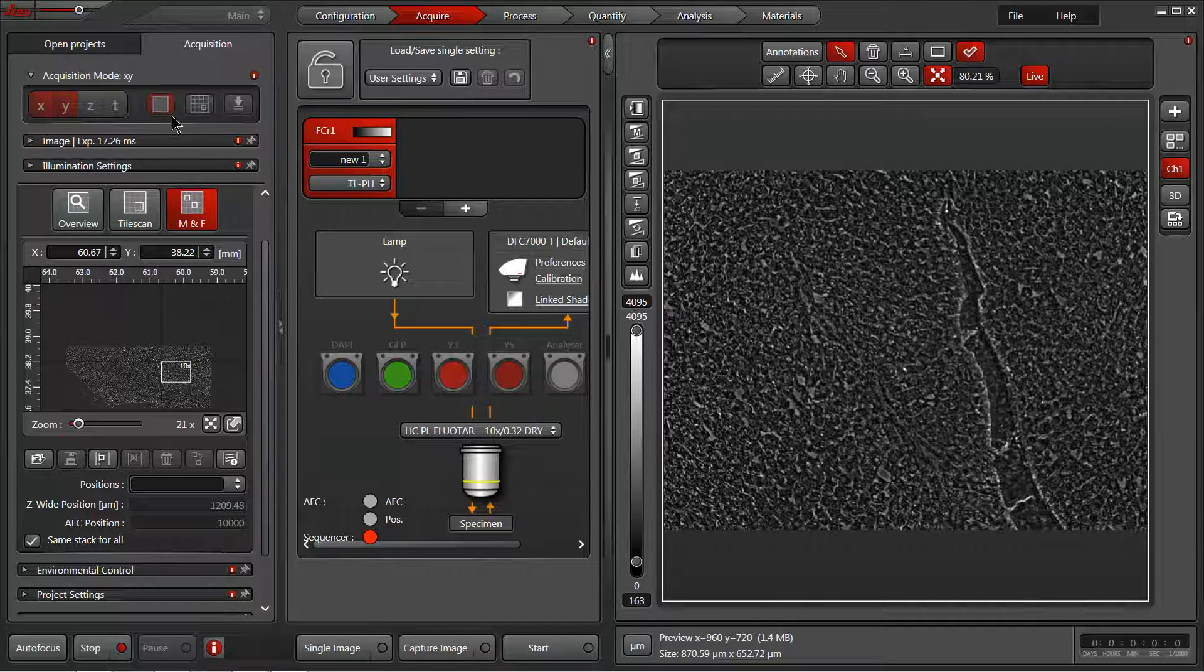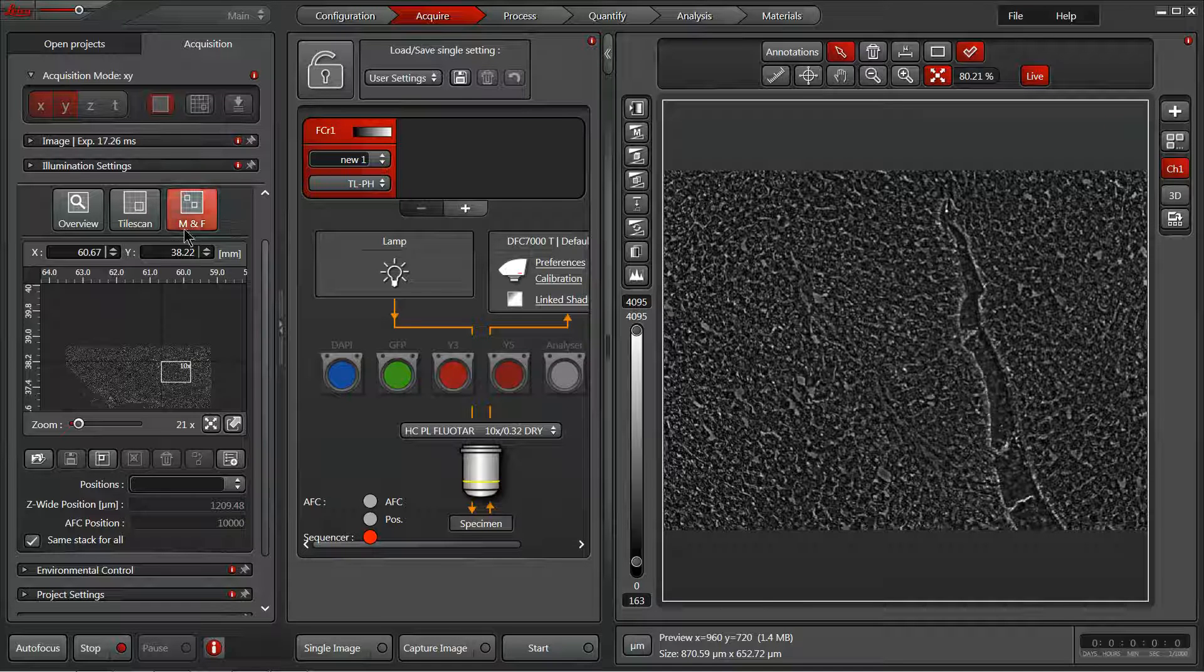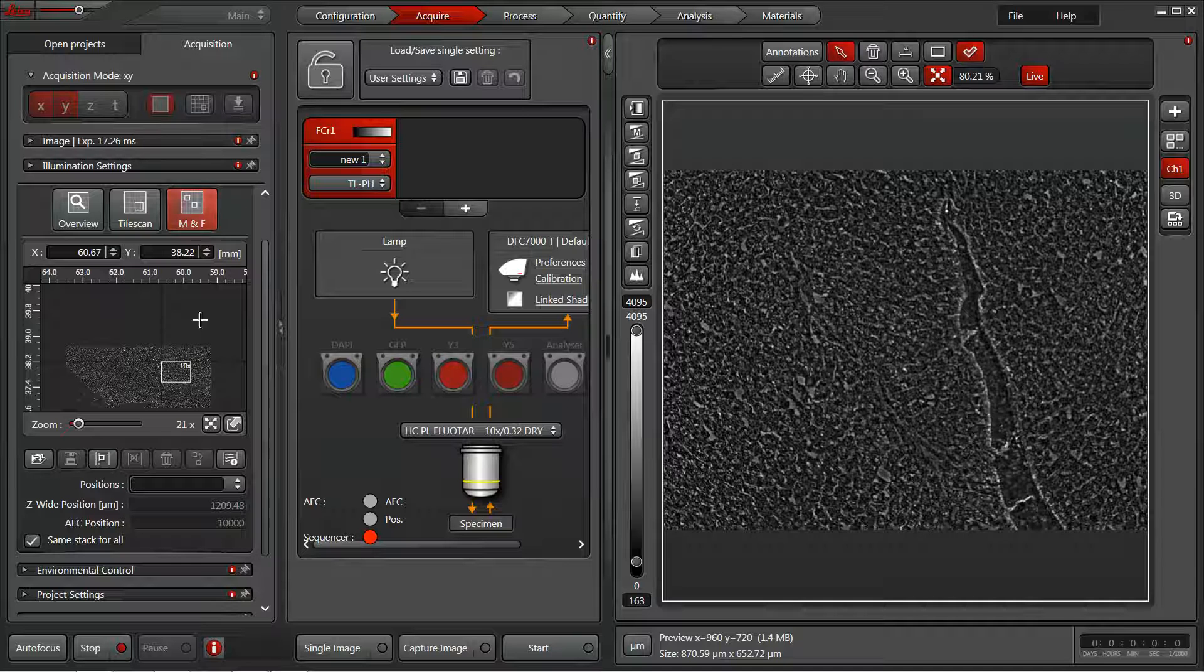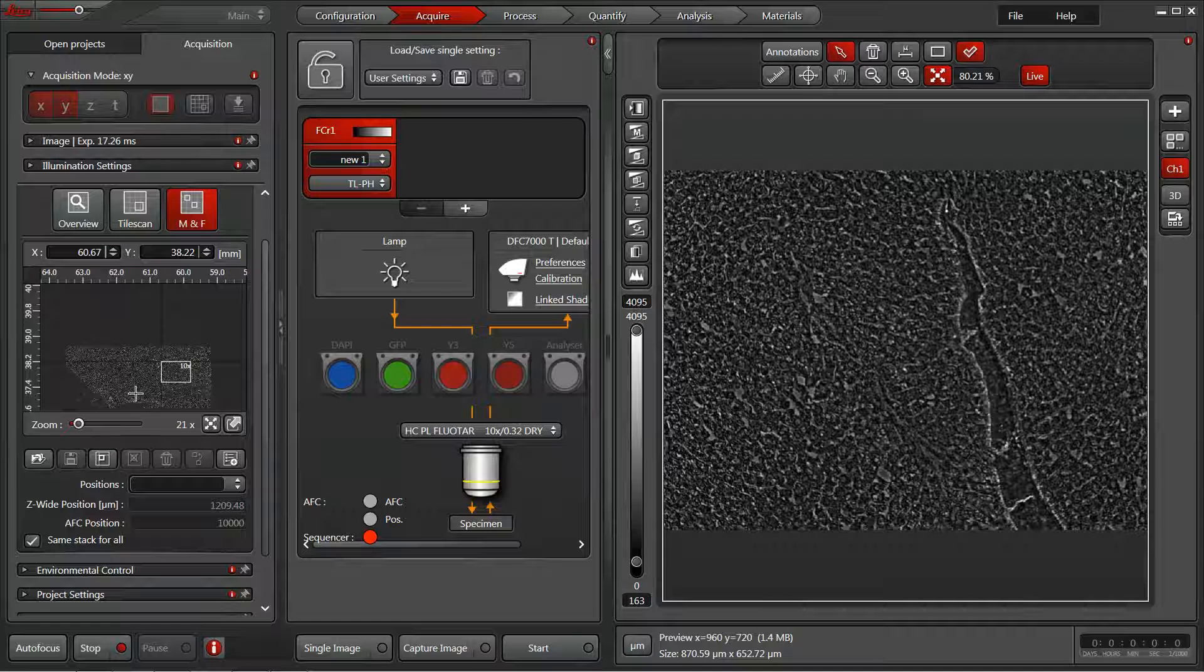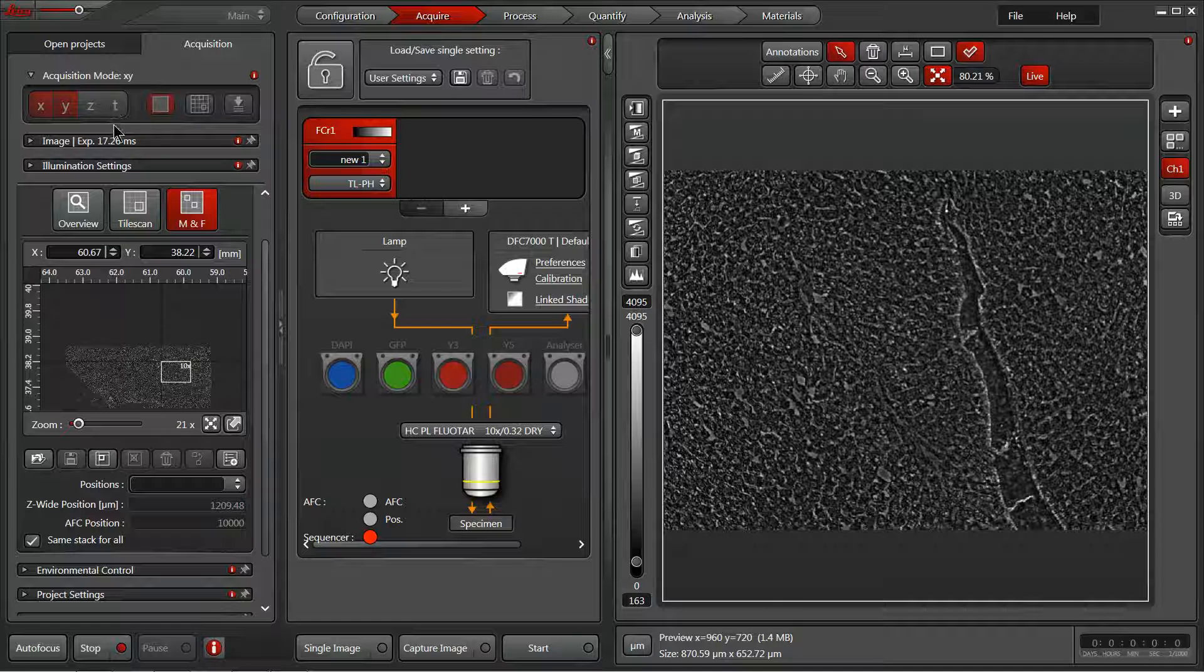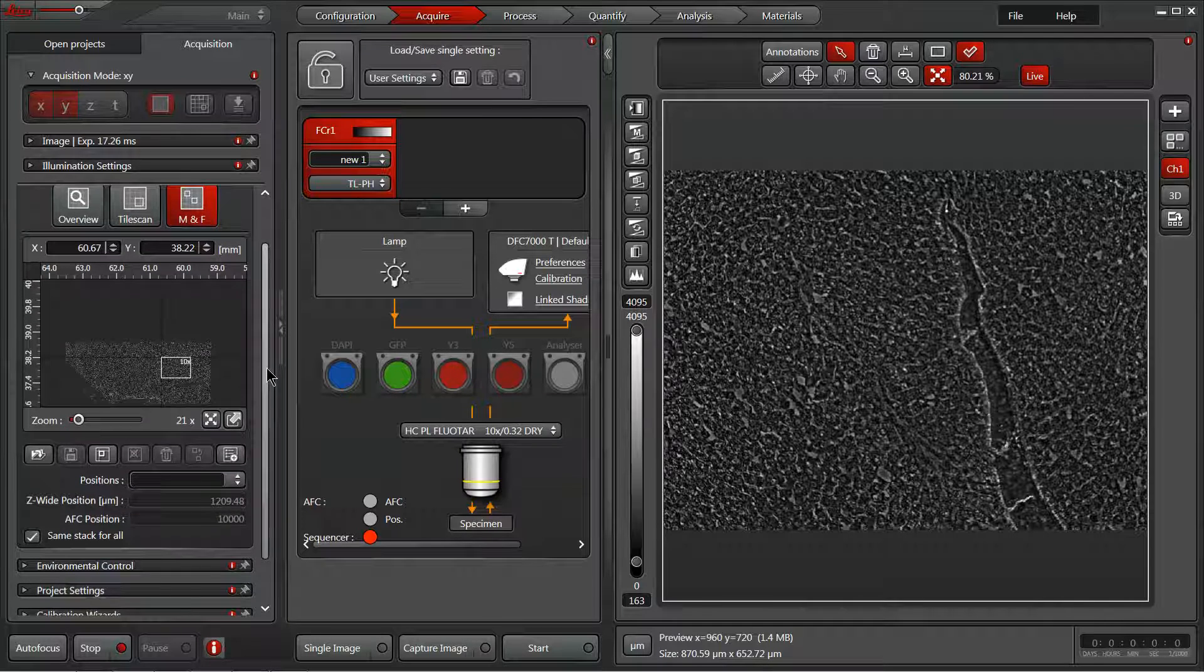Last but not least within our stage experiments is our mark and find stage experiment modality. This allows us to select various fields of view that will be combined with either z or time-lapse series, or equally you could just define different places you'd like to image within a session.